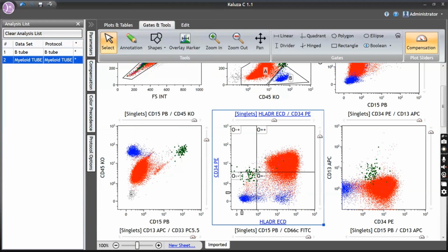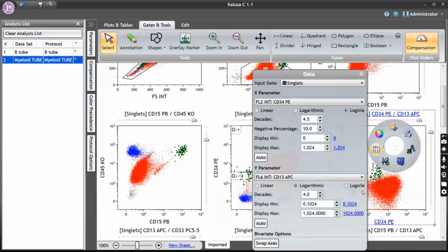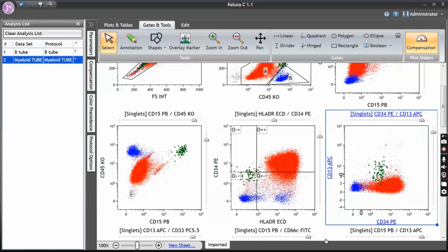Okay, so B cells are positive for HLA-DR in a good fashion. It forms a completely positive population. T cells in a non-activated state are negative for HLA-DR. But when they get activated, they can show you some HLA-DR expression. HLA-DR is an MHC class 2 molecule present in antigen-presenting cells like monocytes and B cells. But when T cells get activated, they can show HLA-DR. Here I can say this is B lymphocytes, this is T lymphocytes. But sometimes when there are many T cells and they show a heterogeneous pattern, another B cell marker would be more useful for you.